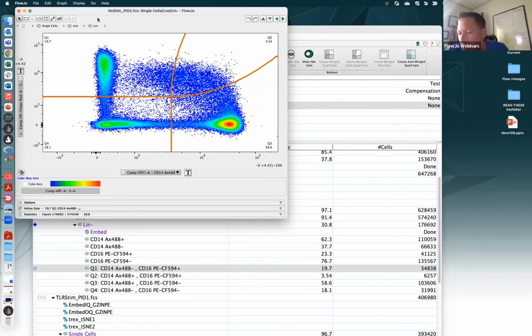So there's a question on using CyCombine across different batches. You have to indicate which batch is which. I think I saw Veronica help out with questions in Spanish before, and if she's still there, I would greatly appreciate some assistance. This one is more than I'm going to handle.